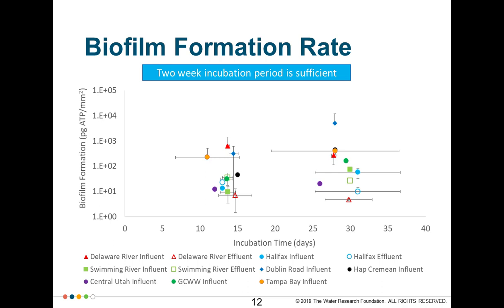and we incubated the coupons for 2 weeks and 1 month because we wanted to see how the biofilm formation compared. We wanted to make sure we had enough growth on the coupon surface that we could get a measurable reading, but we also didn't want to leave it in for so long that we move into a decay phase on the surface of that coupon, meaning the biofilm is fully saturated over that surface and you start getting sloughing of biomass. So we wanted to make sure to capture that growth phase.